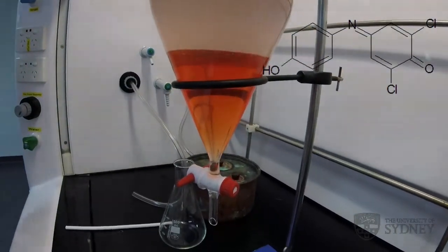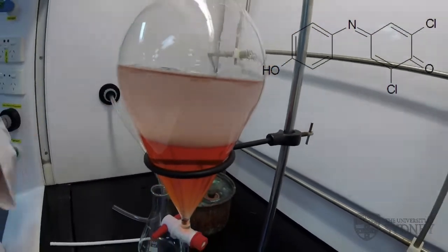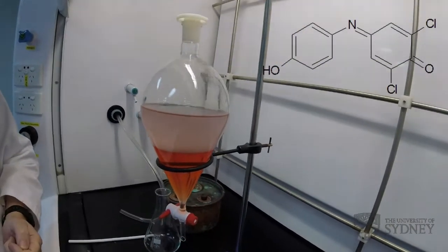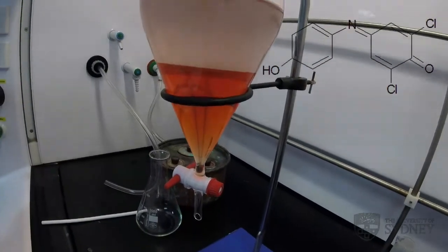And see, that's caused a little bit of emulsification—the cloudiness inside the separatory funnel—so we need to leave that to separate into two clean layers. But you can also see that the neutral acidic form of the dye has extracted into the organic phase as we expected.